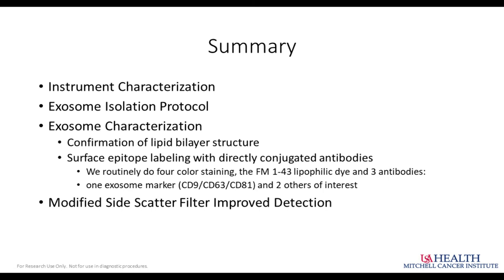I think I mentioned in the beginning, we use patient blood, and that's collected in a green top heparin tube as plasma. It is critical that you do not use serum because the process of letting blood clot traps so many of the little exosomes in the actual hard clot so that when you just dump out the serum, there's very little exosome left in it. So you really have to use plasma. Many of my colleagues use urine, especially looking at prostate cancer. That's a very nice way to isolate exosomes because the urine's actually pretty clean and pure of other things.